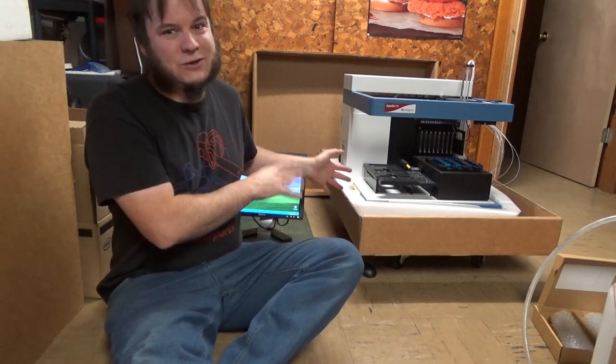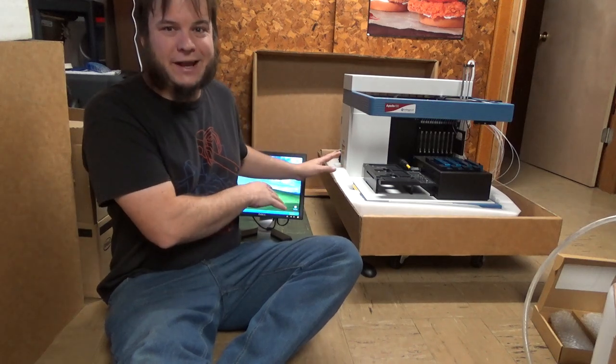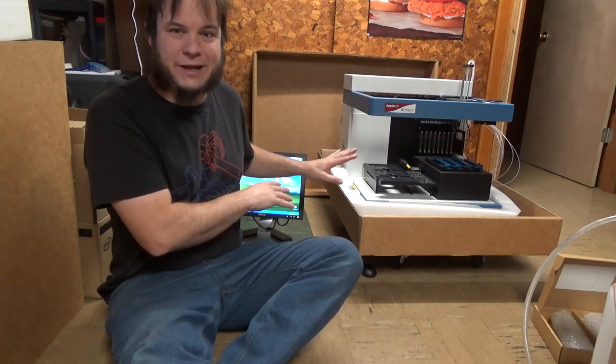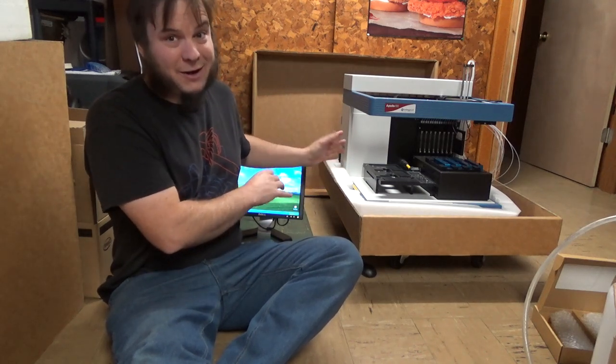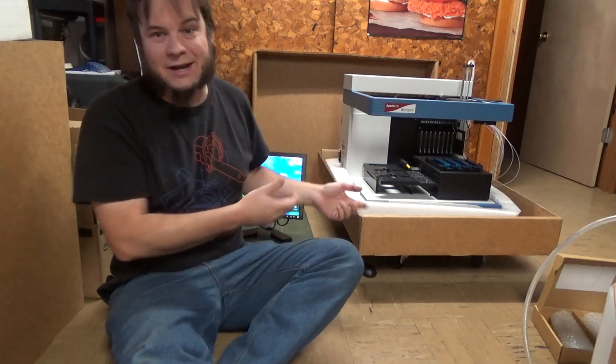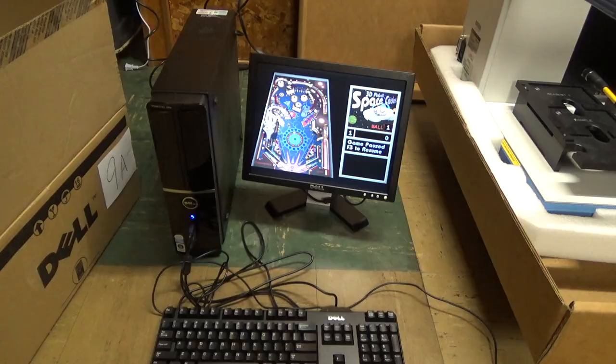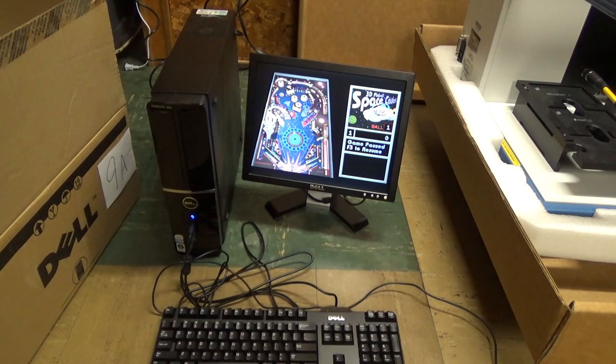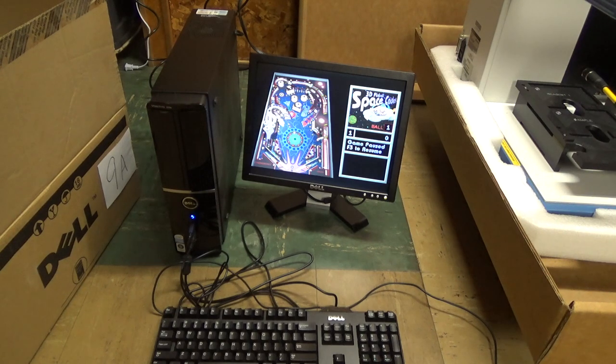I'm sure there are some useful parts in here, so even if we can't hook it up, even if we can't get it running, I could probably tear it apart. I could probably manufacture this into something else, or maybe there's somebody out there on eBay that's looking for some parts for one of these. And I can always use another Windows XP box. I mean, even if I'm not able to commit crimes against nature right off the bat, at least I can play 3D Space Pinball.